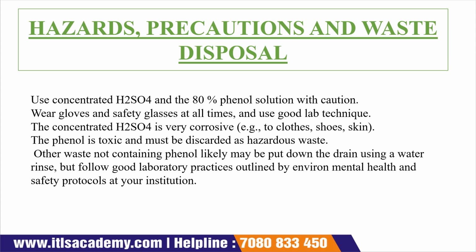Concentrated H2SO4, that is sulfuric acid, is very corrosive in nature, so we have to avoid contact with our clothes, shoes, or skin. And phenol is toxic in nature, so when we discard it, we have to discard it as hazardous waste.